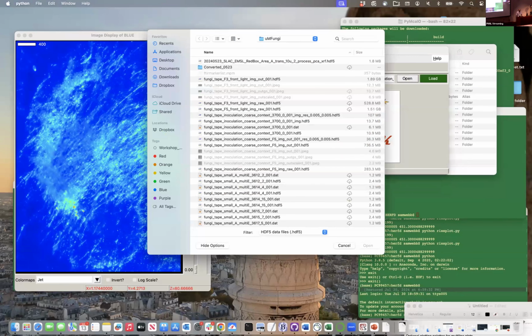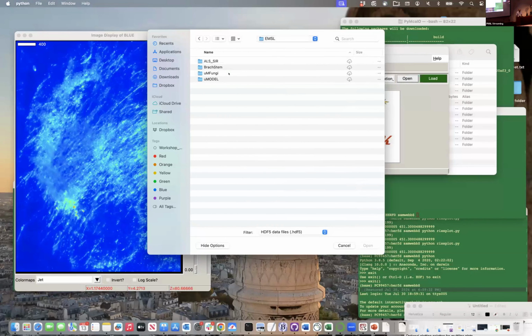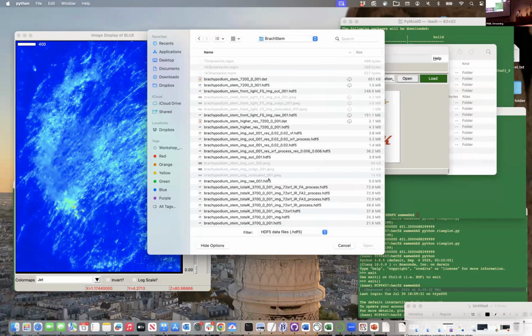We are going to move over. We'll go to the stem here. So this is going to be infrared data that will merge into our XRF data. So this will be fun. We have our data here.